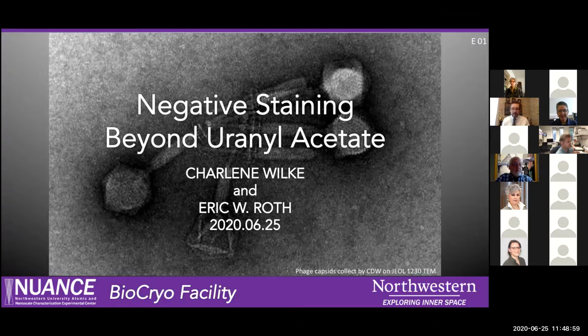Hiro asks, can you mention a bit about other contrasting agents such as osmium? I'm looking to see if anyone has a dedicated hood for such processes. We do not have a dedicated osmium hood, but you definitely want to be careful with osmium. If you're staining with osmium, typically it's in more of a vapor state as opposed to liquid state. There's another one, ruthenium red, for staining polymers. Again, that's done in a vapor state. So no, we don't have any dedicated hood space for that. But if you can make up little moisture chambers with some Petri dishes, it can be safely done in a hood.